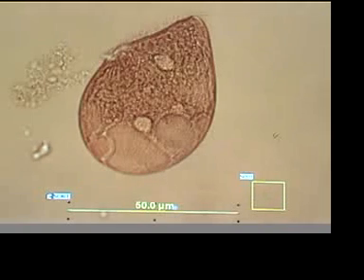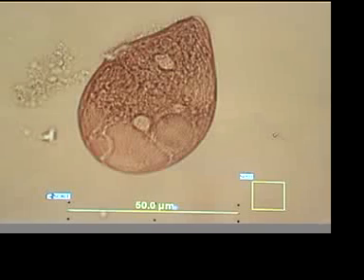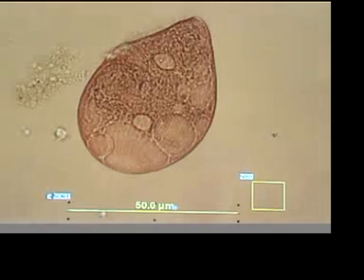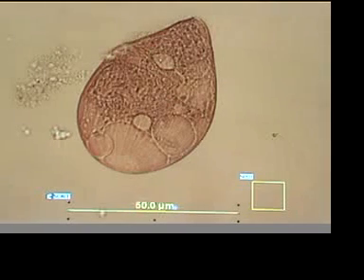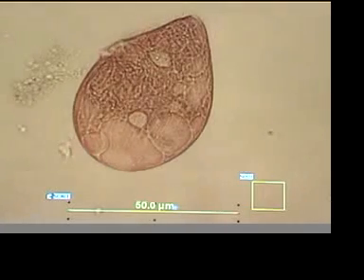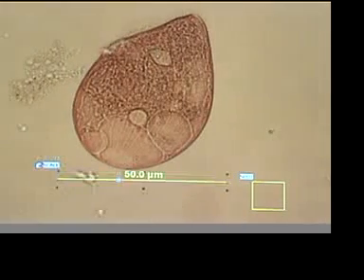Let's watch the overall shape of the organism. And I will adjust the focus. This is happening in real time. And here's the scale.